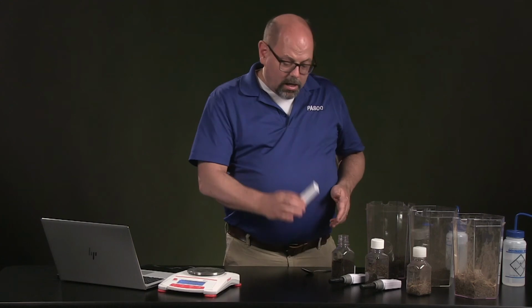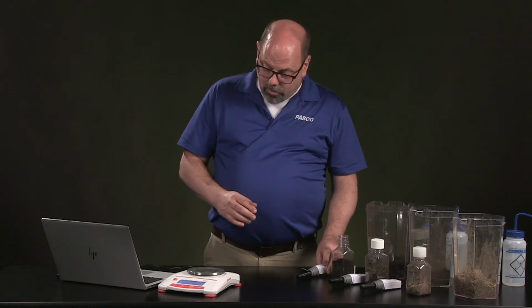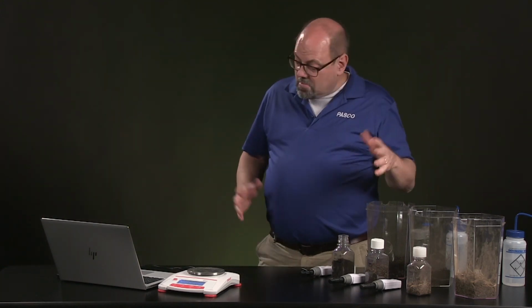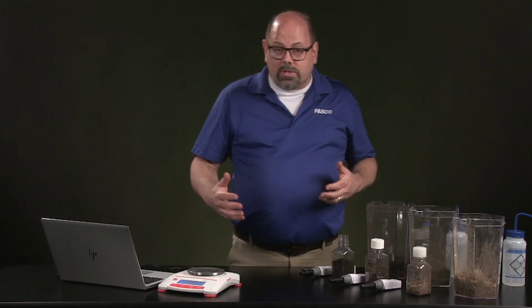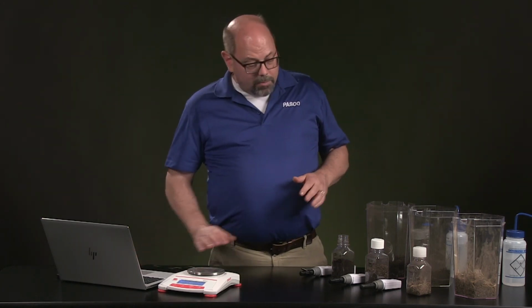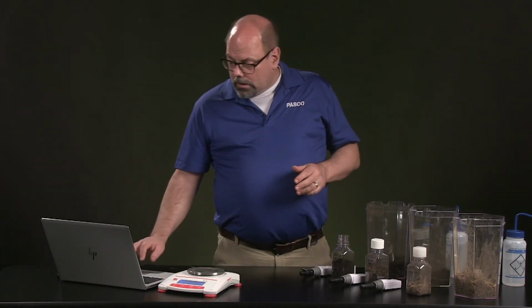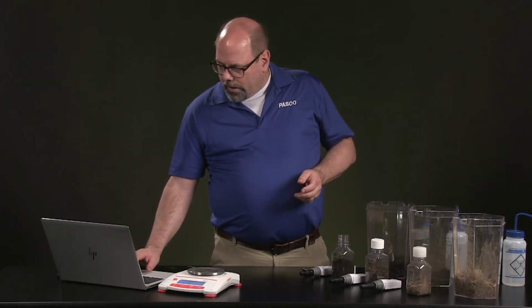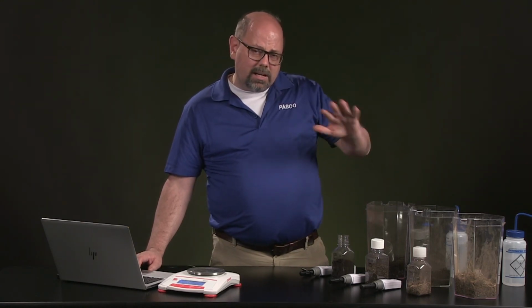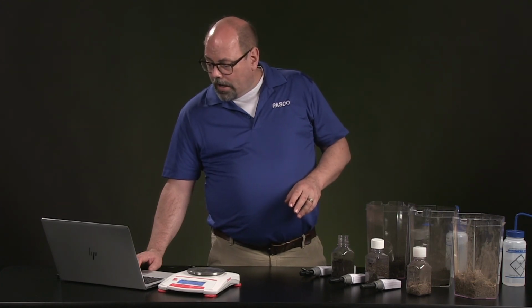we're going to put in one of the CO2 sensors. In order to do that, you're going to be able to measure all of those at the same time so you can follow the experiment and see which one's got more activity. Again, we're looking for more activity in each of these soils. I'm going to start from dry so we have that as a comparison, as dry as possible. In this area, it hasn't rained for a while, so that's a good start. And then for the store-bought one, I just put it outside in the sun, and it's been about a 90-degree day, so we're hoping that that's pretty dry.